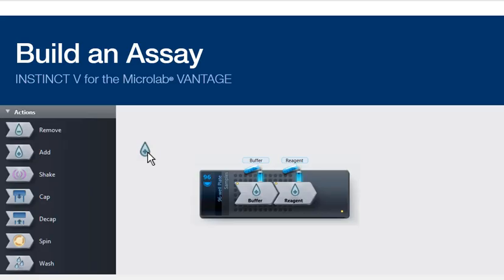This video shows how to build an assay. It is for anyone new to InstinctV or anyone who wants to refresh their basic knowledge and skills.